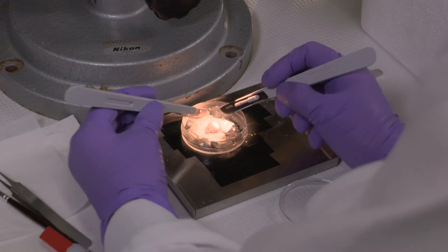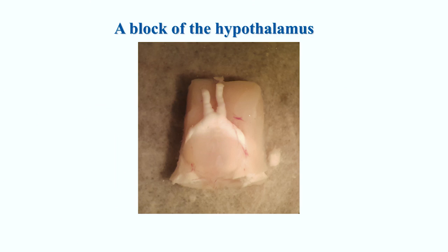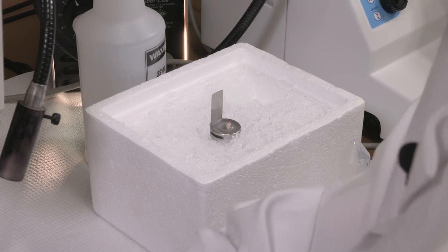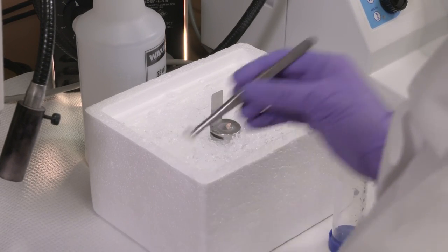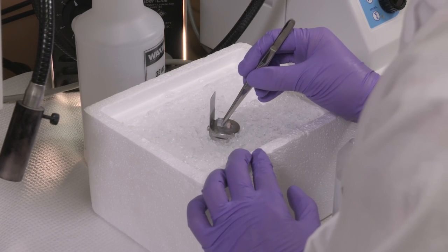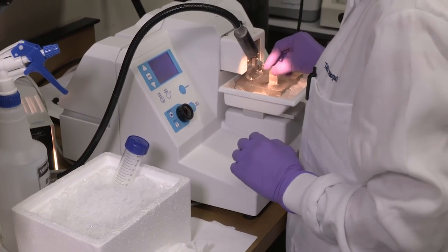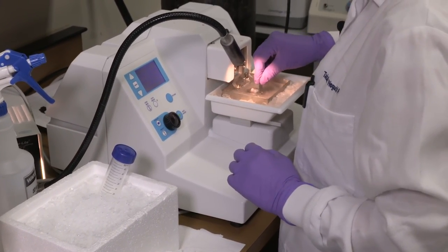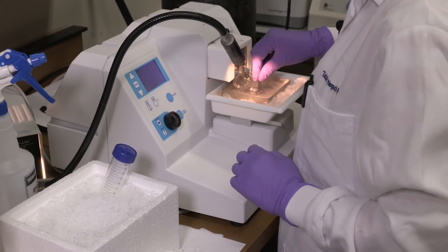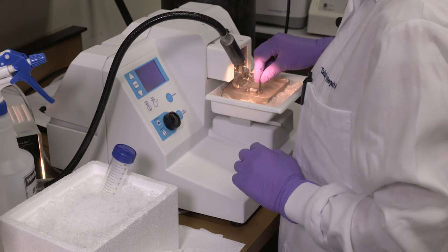We cut the hypothalamus out of the brain. Once we have dissected the hypothalamus, we glue the hypothalamus containing the SCN onto a specimen holder and hold it in place with a piece of 2% agarose gel. Then we will use a specialized instrument called the vibratome to carefully prepare very thin slices of the dissected hypothalamus.